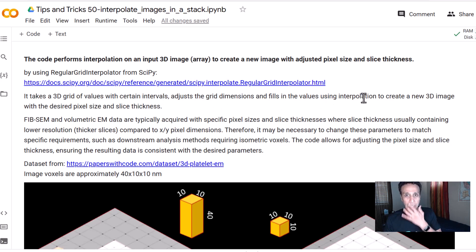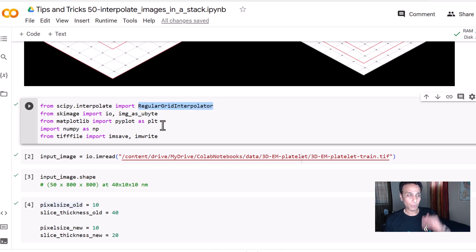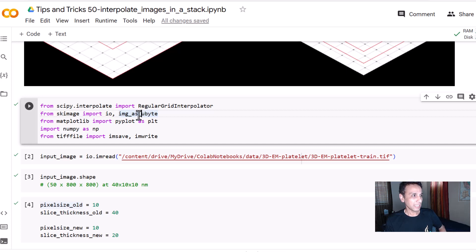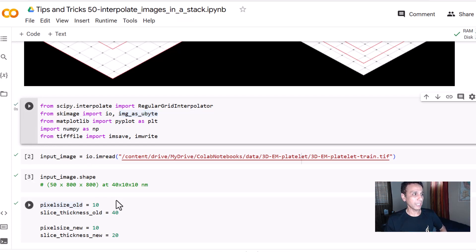Let's go ahead and import it. In addition, we import scikit-image IO to read the image, a function to convert to 8-bit, matplotlib for visualization, numpy, and tifffile — I'll use imwrite to save the output file as a TIFF format with embedded metadata, so all the pixel sizes are embedded in your TIFF file.